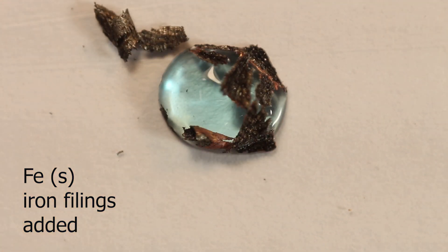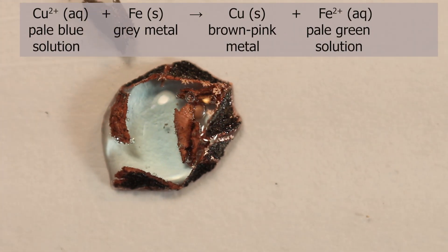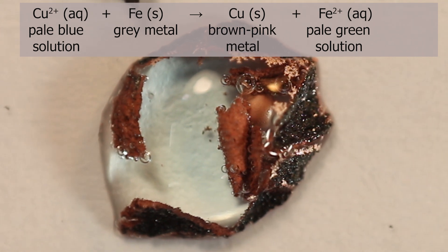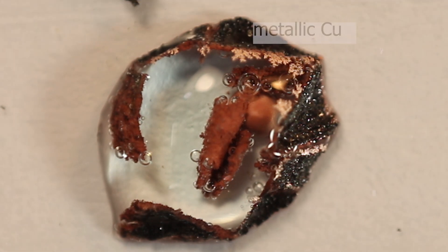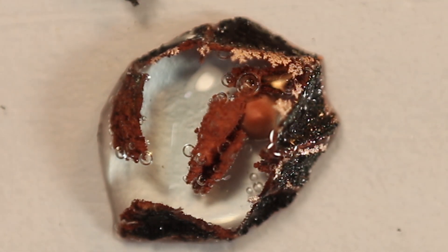Iron metal is above copper in the reactivity series, so it is displacing copper II ions from solution. Iron atoms are oxidized and copper II ions are reduced into copper metal. So formation of brown or pink metal, positive result for copper II ions on addition of iron filings.